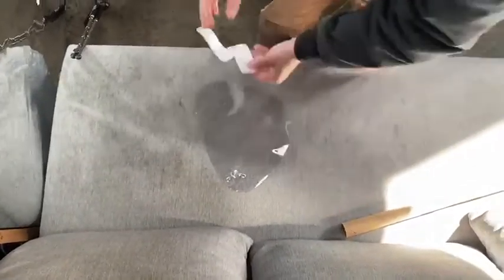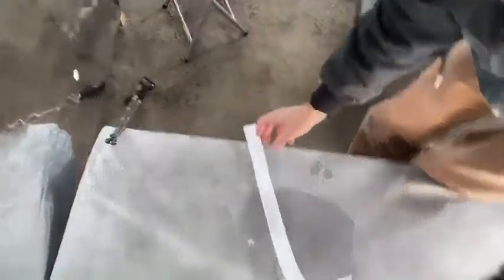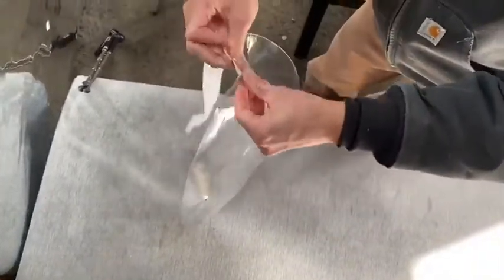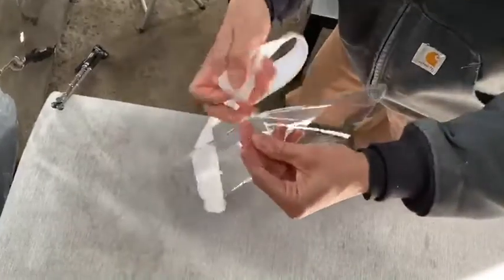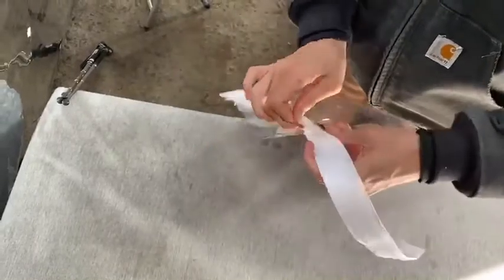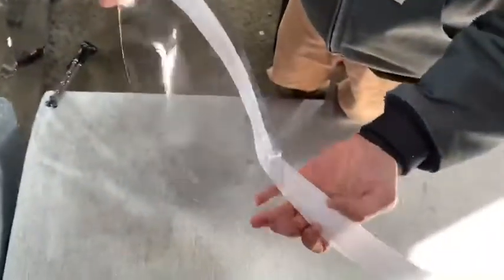So all you need to do to assemble it: place this down on a table. You take your band with the Velcro-y part on the right, and you're just slotting it through — one and then two. Make sure that the side with the Velcro is over here, and then there's another side of the Velcro on the other side, but you want that facing out.